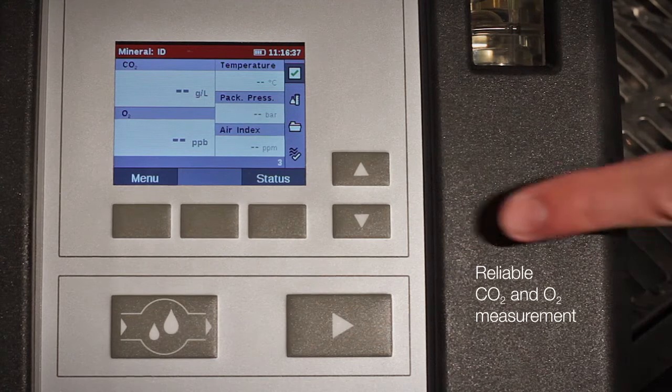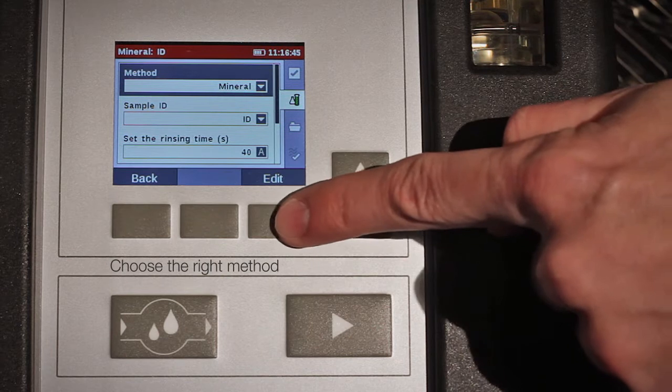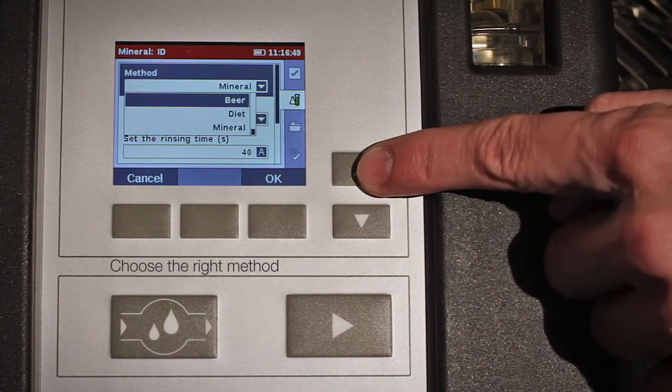Perform the following steps for reliable and correct results. Press the sample key on Cbox QC ATLINE and select your method and further settings of choice.